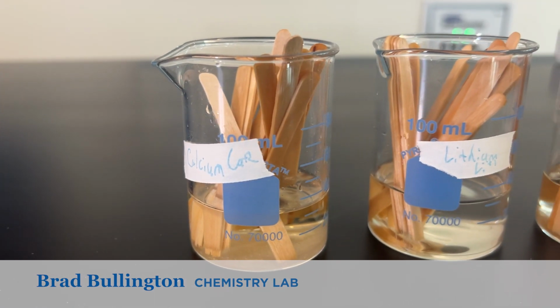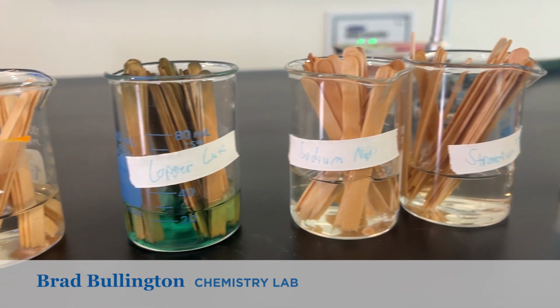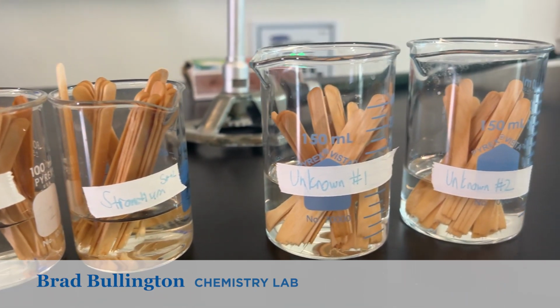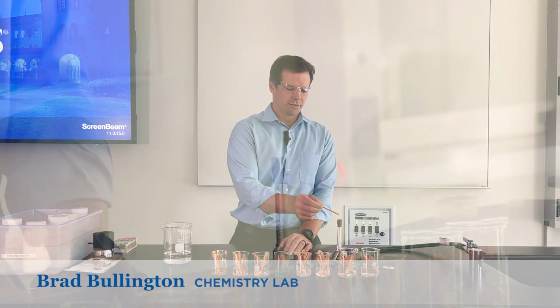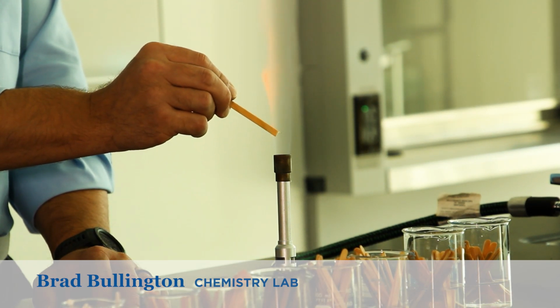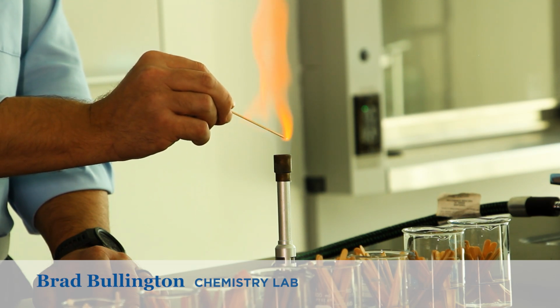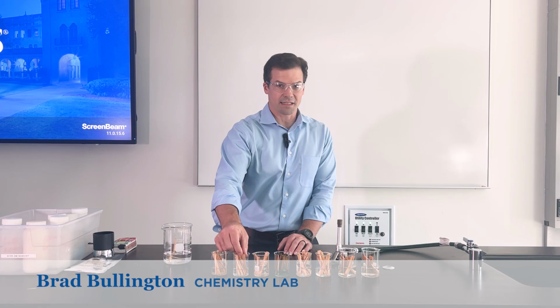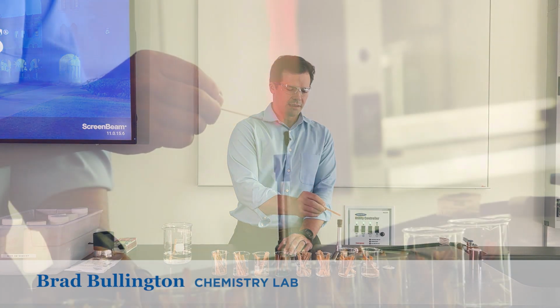So we're going to go through each of these, and I'd like for you to pair the flame color that you see here with the fireworks display on the cards in front of you. The first metal that we're going to see is calcium. So this is the flame color that is exhibited from excited calcium electrons. The next is lithium. This is the flame color that is exhibited from excited lithium electrons.